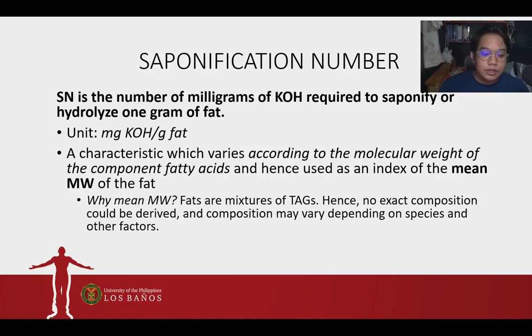Okay? So, why mean? So, ito yung sinabi ko kanina, fats are mixtures of tags. Okay? And hence, no exact composition could be derived. And we make use of mean molecular weight since yung ating composition ay varying depending on the species and other factors.